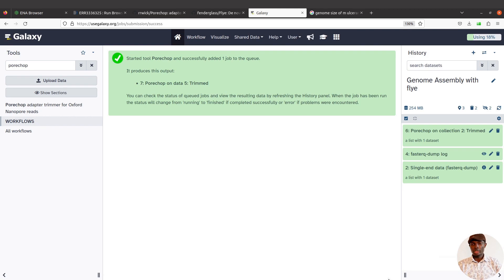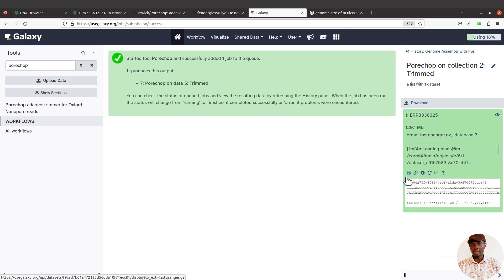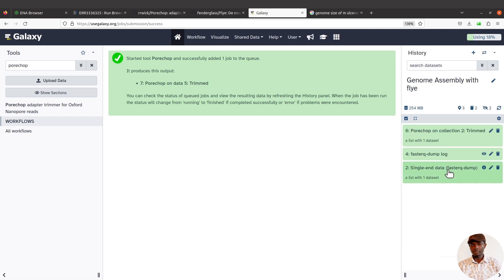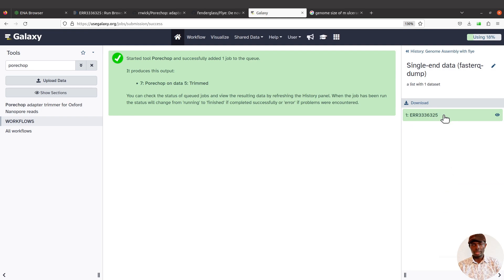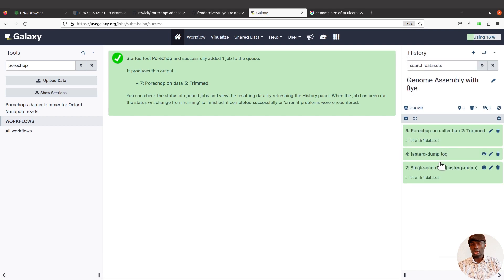Porechop has completed. We have the outputs — the trimmed reads and the raw reads, both as dataset collections. If you want the actual data, click the collection and the file will be shown. You can click the download icon to download the trimmed reads or the raw reads. So that's how you access the output files.